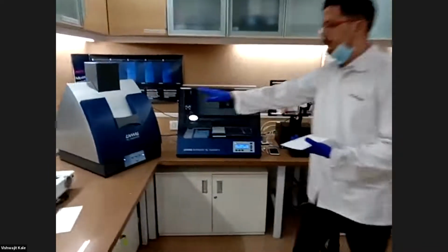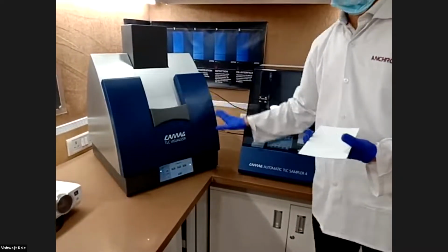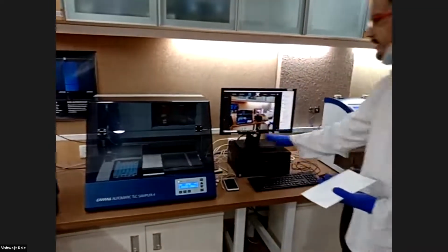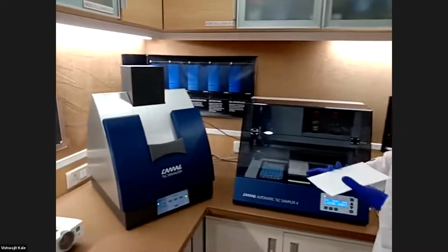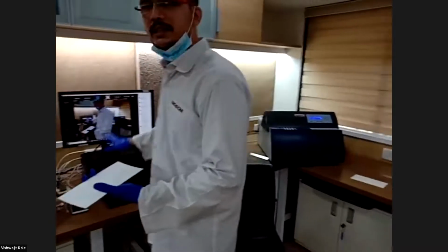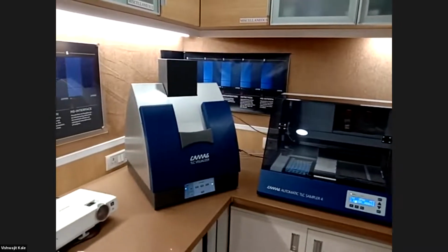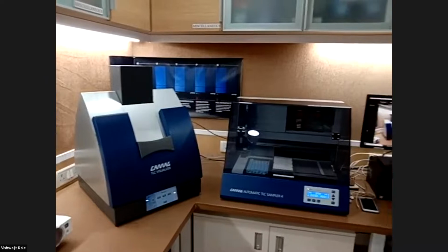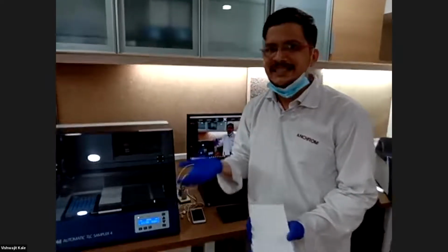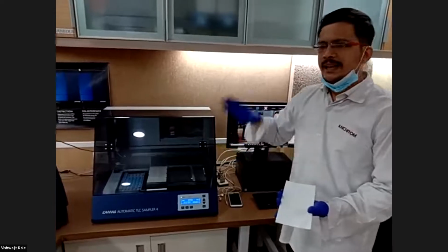So this is the complete HPTLC system and different modules of HPTLC by CAMAG. All these modules are connected to a centralized server PC. So this is the server PC connected to all modules by LAN cables. All modules are already switched on and connected to this software on the centralized server PC. This system has a client server based architecture. So we can connect one HPTLC system with one server PC, and that server PC we can connect to many other PCs, many other clients. So many other users can operate this one single HPTLC system at the same time.